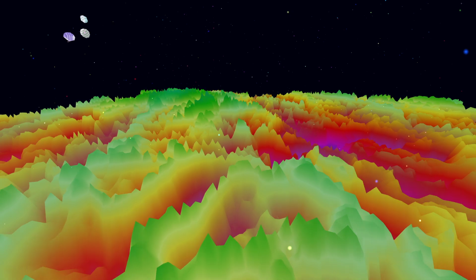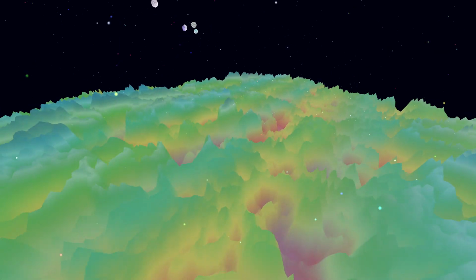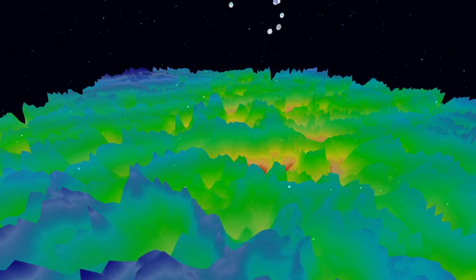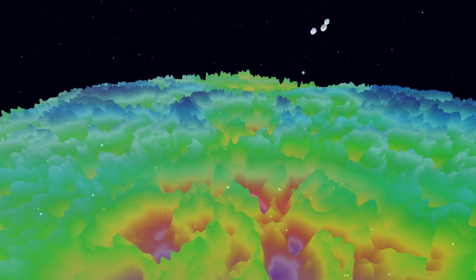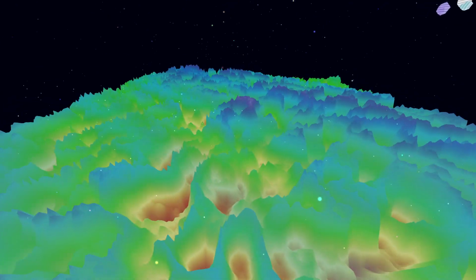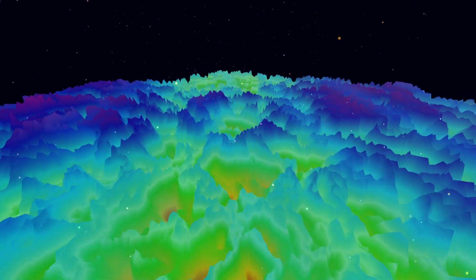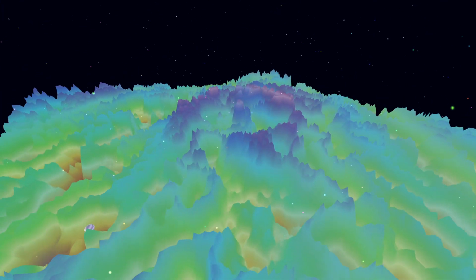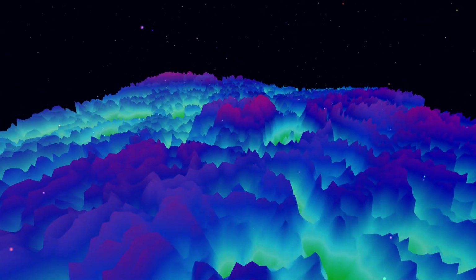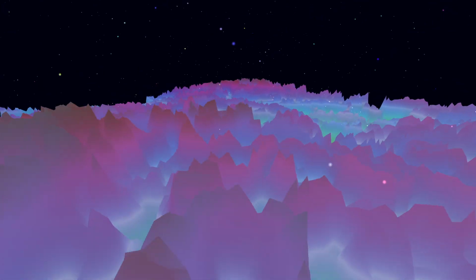Well, this has been fascinating, a really great deep dive. I think the big takeaway for me is just how much information you can get about a material, what it's made of, how it's put together chemically, how its electrons behave, just by carefully measuring the energy of electrons kicked out by light. It's a powerful concept, isn't it? And remembering the two main flavors, XPS, using X-rays for core levels, giving elemental and chemical state info, and UPS using UV for valence levels, revealing electronic structure and bonding, helps frame it. They offer complementary views. Right.